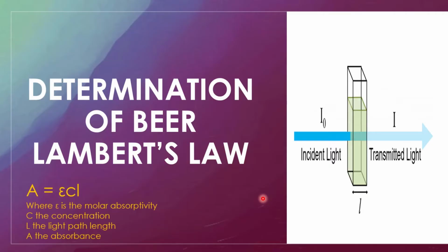And I also advise that for a theoretical understanding of Lambert's law, I will encourage you to watch my video on Lambert's law. And also, this experiment happens to be a continuation of the experiment to determine the wavelength of maximum absorption. So again, for a better understanding of this experiment, I will encourage you to watch my video on determination of wavelength of maximum absorption.